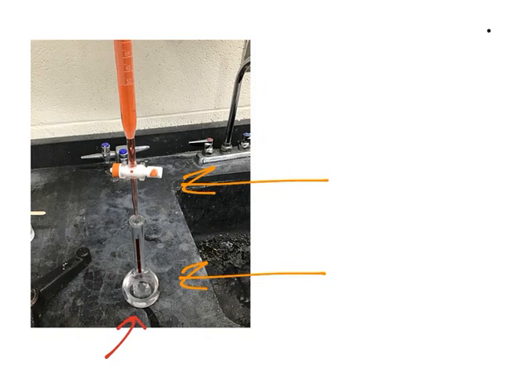Again, that is for safety purposes. You always add your strong acid, which is the red above. You always add your strong acid to water. So there's approximately 50 milliliters of water in here, but that's not what's important. We're going to open the burette until we've deposited our 10.42 milliliters.